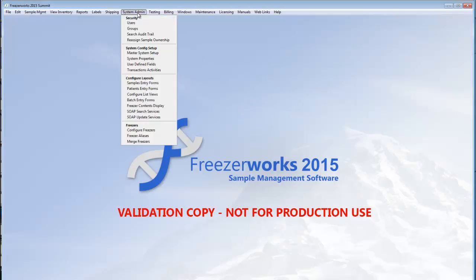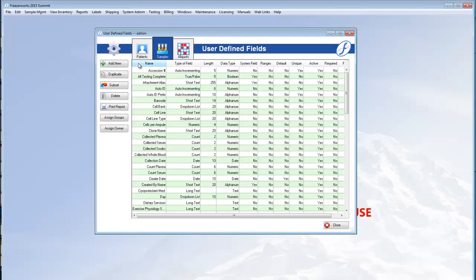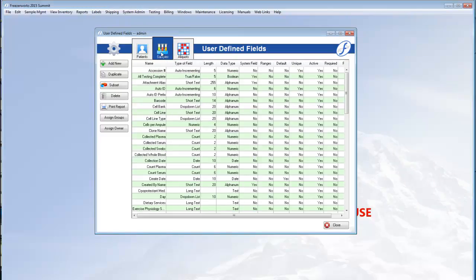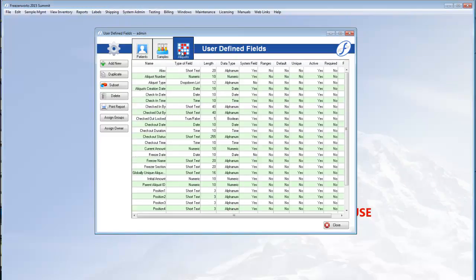First, we have to open System Admin User-Defined Fields. The list view is divided by table: patients, samples, and aliquots fields. Click Add New to get started.